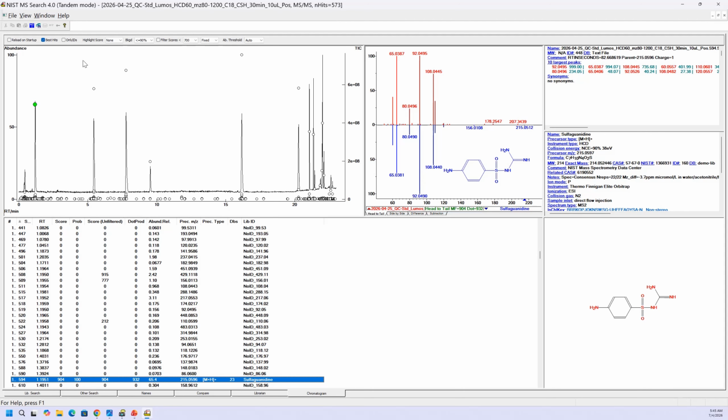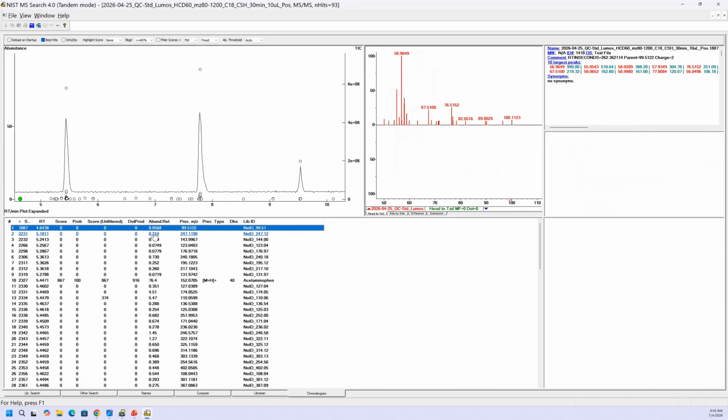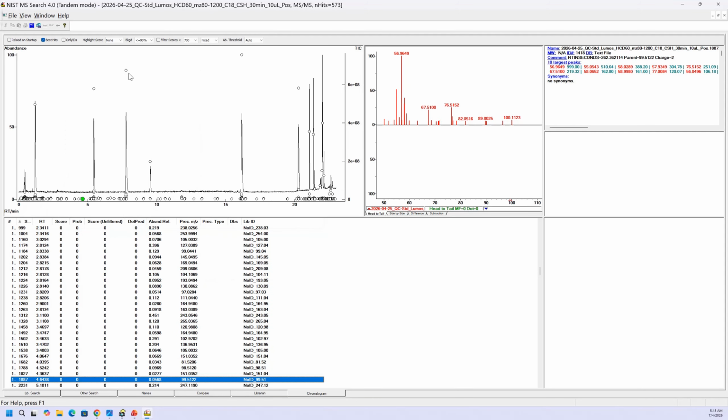Of course, within this data, you can left click and drag and only get the ones shown within this area. And if you double left click, it goes back. You could have said undo zoom. Up here, you can zoom the results also if you want to.